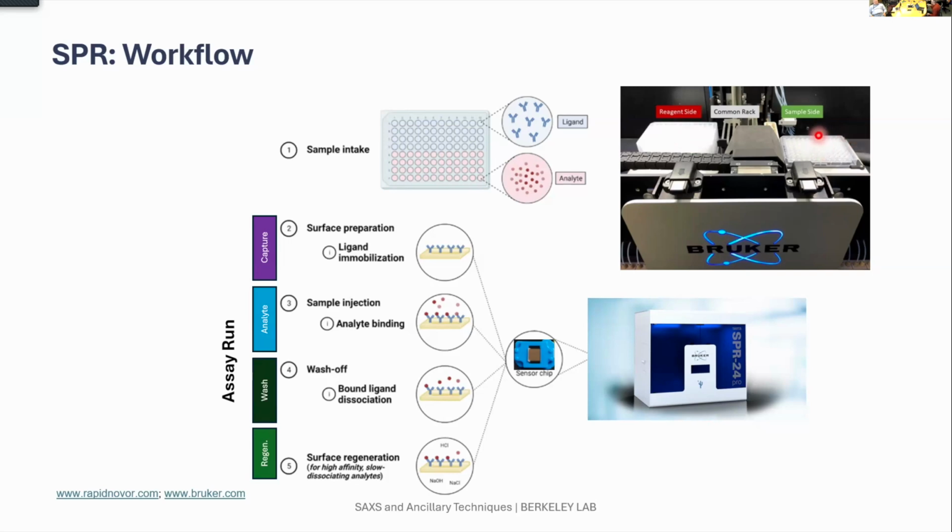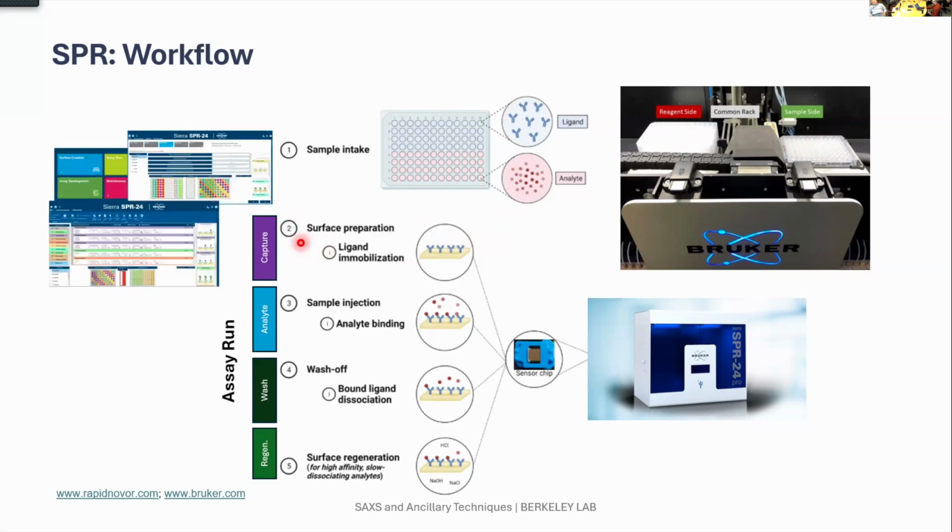These samples contain things that we want to attach to the sensor chip, like the protein you analyze or an antibody, whatever. All of those are programmed in nice user-friendly software. They really have everything color-coded, so you always know what stage you are on. First you have everything prepared.